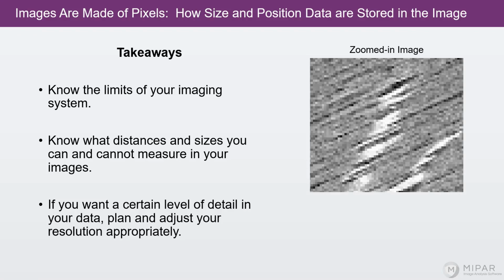Nobody really knows. So you can make an educated guess that this is one line here that was cut in the middle because of how they continue like this. But technically that information isn't stored in the pixels itself. You have to make some assumptions in order to come to that conclusion.